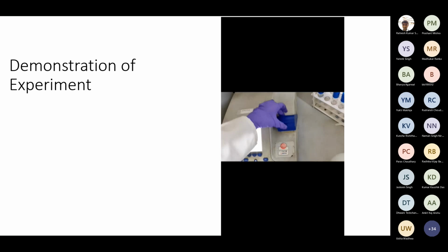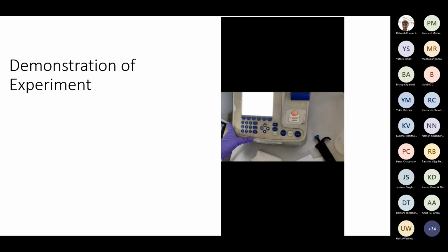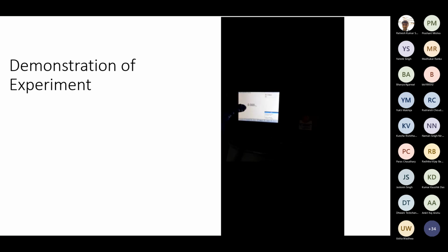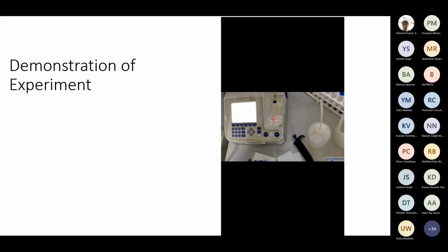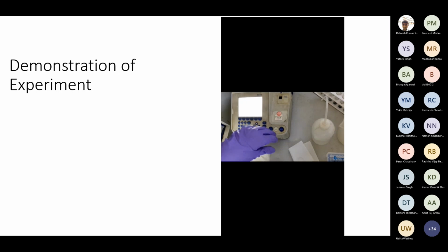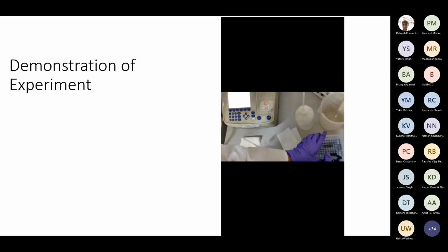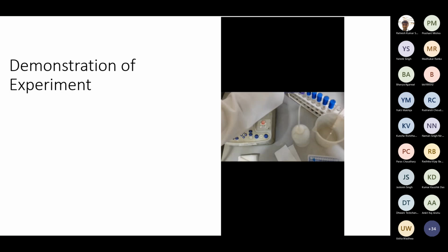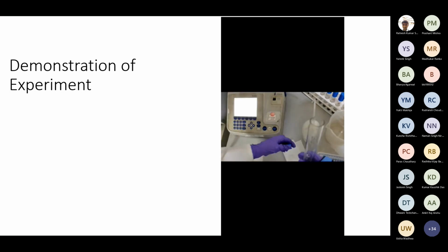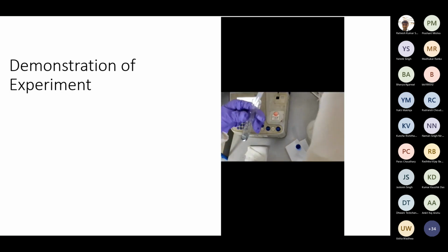Now we will set the blank in the instrument. Here the absorbance is 0. Next, we should wash the cuvette after every use, but since it is blank, we can use the protein sample just after this without washing.